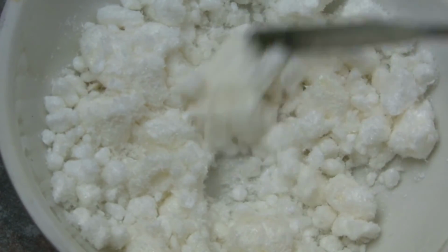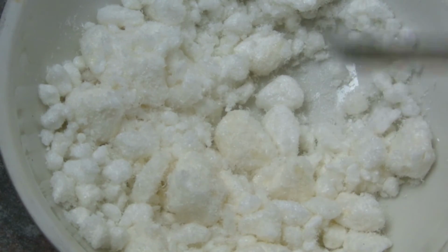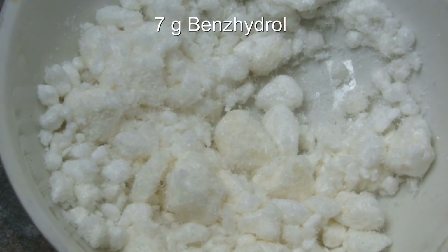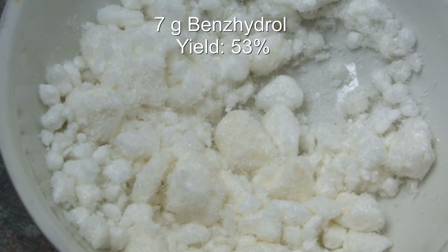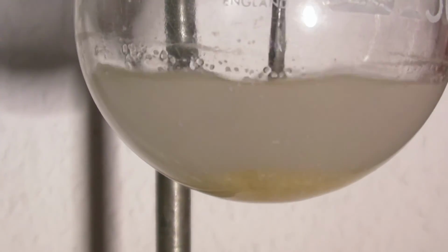There is no specific test for benzhydrol, that's why the next synthesis will serve as proof. I obtained 7 grams of benzhydrol, which is a yield of 53%. This was the recrystallization of benzhydrol.